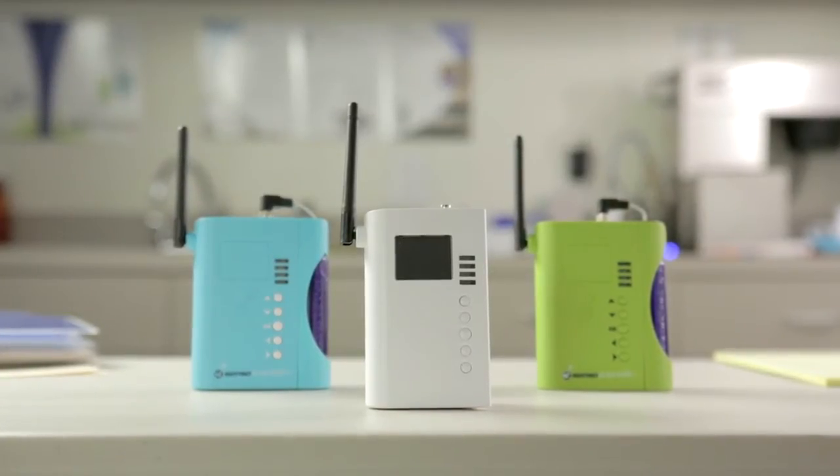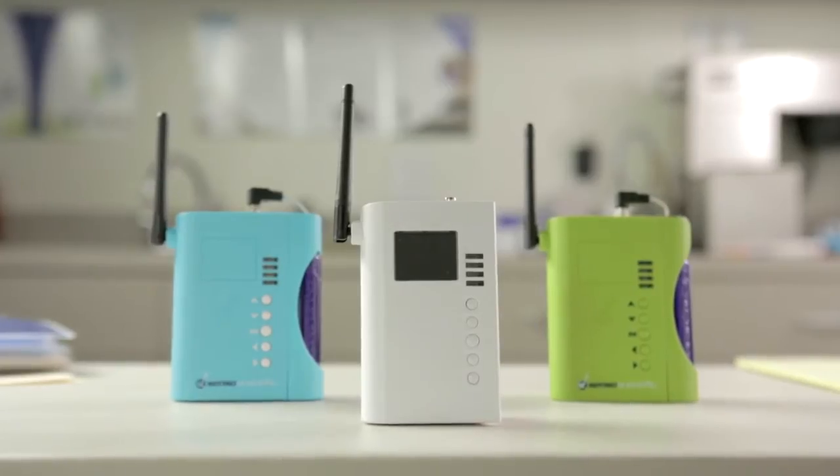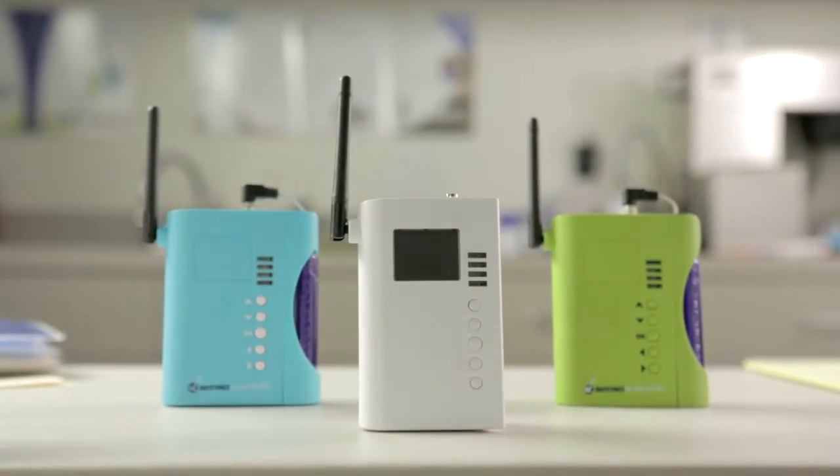At Senso Scientific, we achieve simplicity through innovation. Here's just how simple the Senso Scientific remote temperature monitoring system really is.